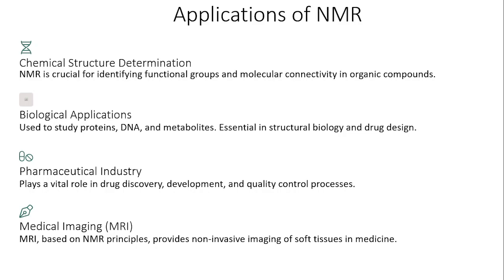High resolution NMR techniques are used to analyze their structure and dynamics, which is crucial in understanding biological processes. The pharmaceutical industry uses NMR for drug discovery, structural analysis, and quality control. NMR's role in medicine, particularly in MRI, is widely known, where it allows non-invasive imaging of tissues based on hydrogen atoms in water molecules. This application is indispensable in diagnostics.